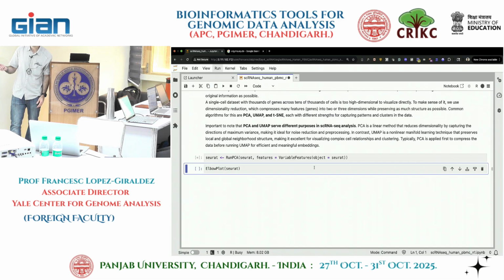And we are only using 3,000 genes. It's the ones that we selected as the top variable genes. We are not using the whole data set because, again, the PCA generally doesn't care about the genes that don't vary.